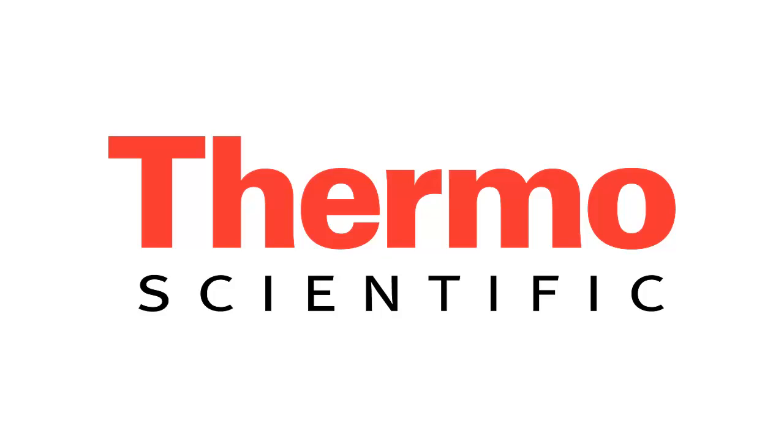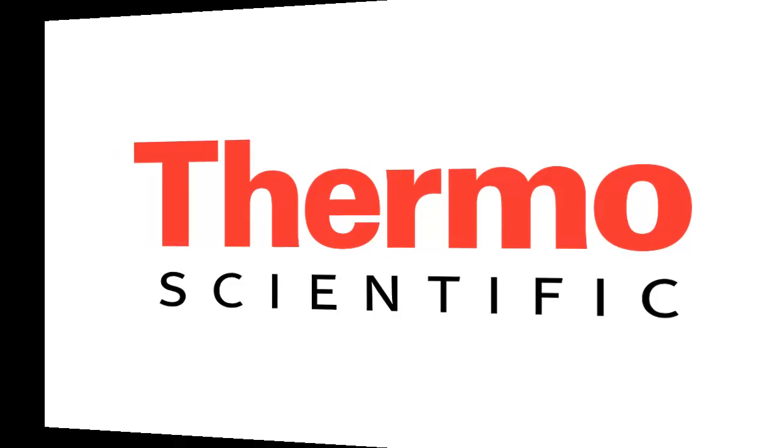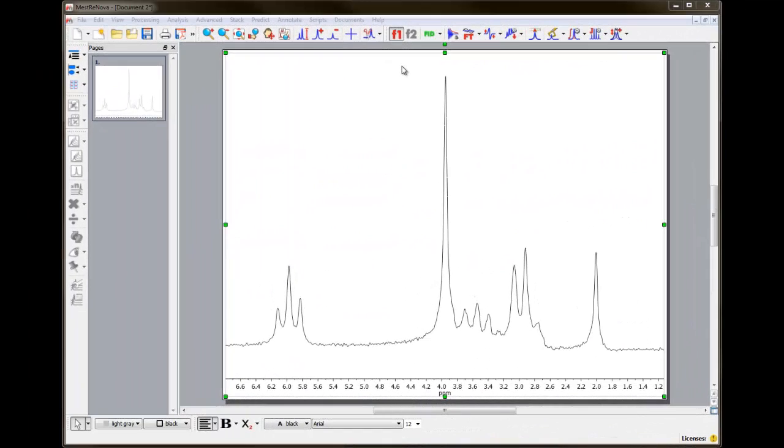In part 4 of this tutorial on basic processing techniques of PicoSpinJCAMP data using the MNOVA NMR processing software, we're going to cover the subject of chemical shift referencing. So let's shift reference the spectrum.